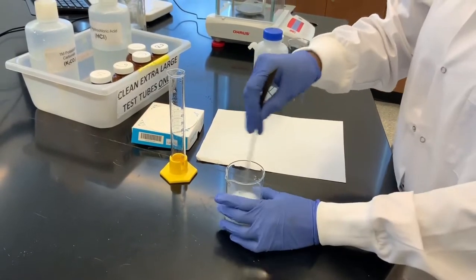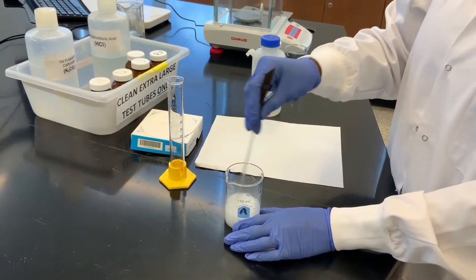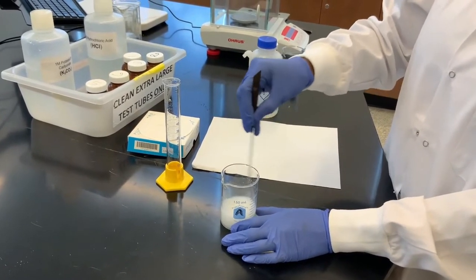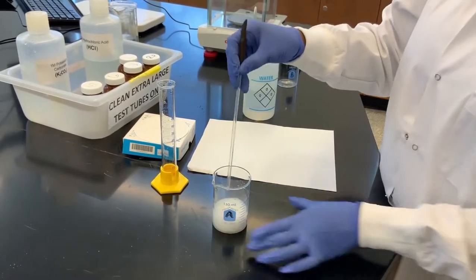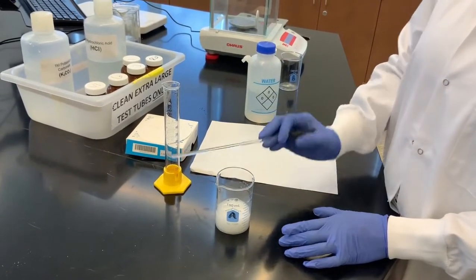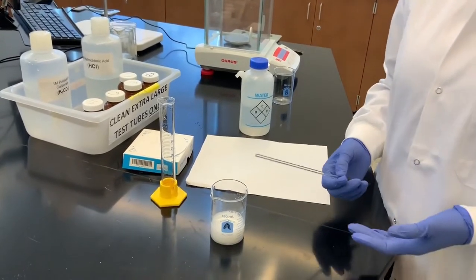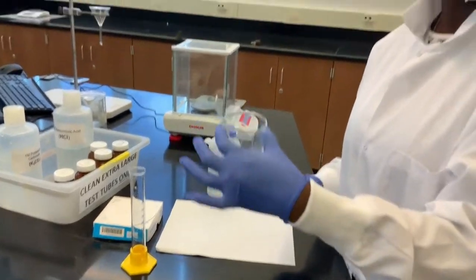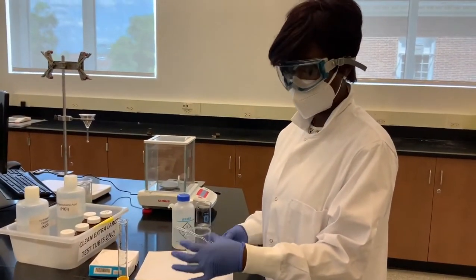Okay, so you have to think about this. I have a 3-component mixture made up of calcium carbonate, sodium chloride, and sand. If I add water, what's going to happen? Which one is going to dissolve in the water, and why? It's something you need to think about as you go through this experiment.